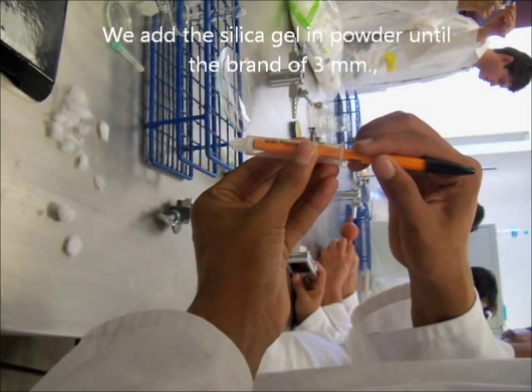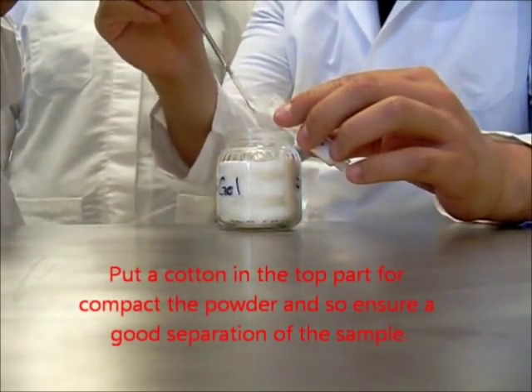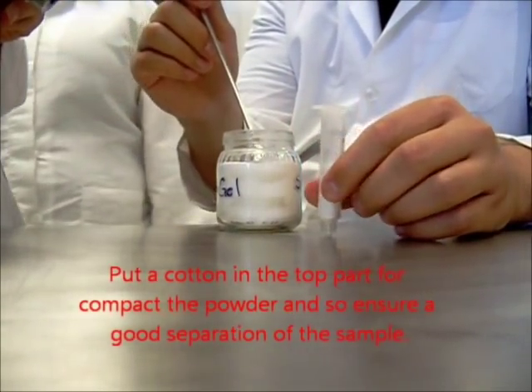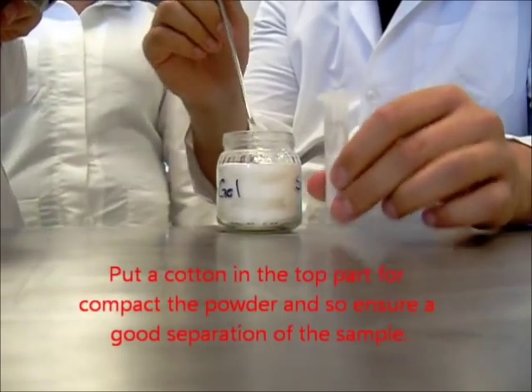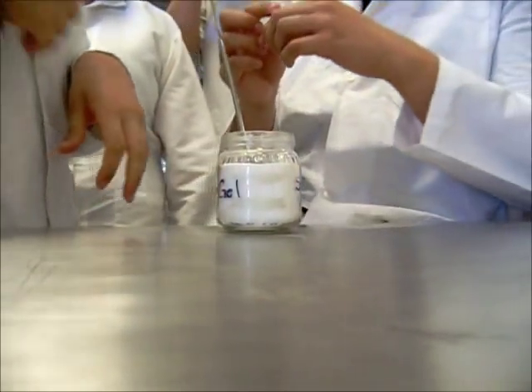We add the silica gel in portions until the mark of 3 cm. Put a cotton in the top part to compact the powder and ensure a good separation of the samples.